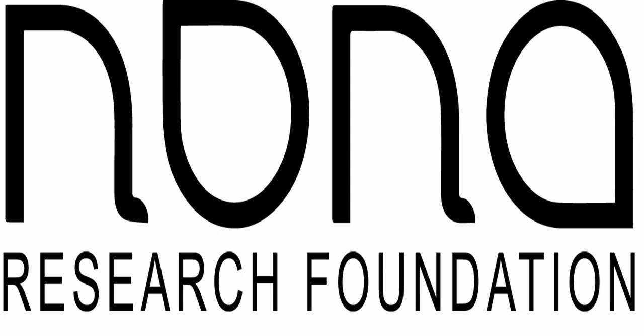Sort of finding the right platform of tools that all integrate with each other and make integration happen. I think you mentioned, Dr. Hart, MedPlum. MedPlum is a great example of an open source LIMS-esque software where they built on what was already there and said, well, let's make this little tool, let's make this little tool, and what they needed to be compliant, and teach people how to install some of those small sub-applications.